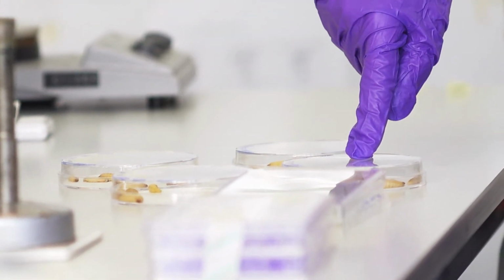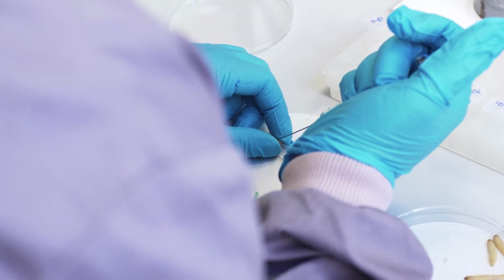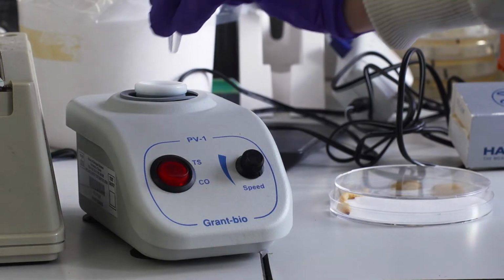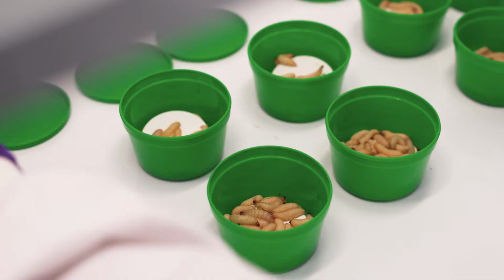These larvae are inexpensive to buy. They don't need to be fed or watered. They don't need to have special facilities. You don't need a home office license. They have a nicely defined injection site actually on them so that you can say this is the point at which the infection has been injected. They are quite easy to score as well.